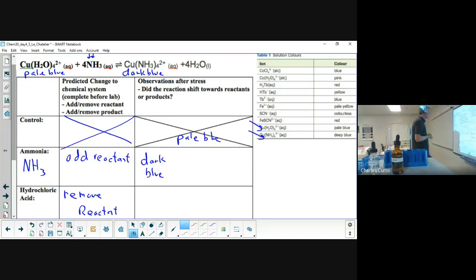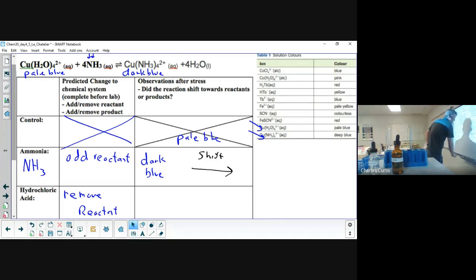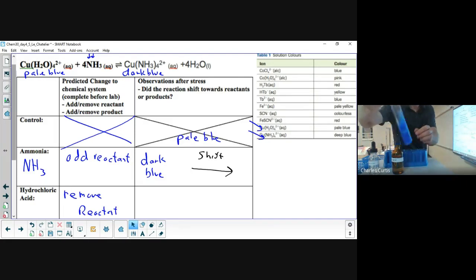So adding that reactant is making it go dark blue. Dark blue is a product. So it's a product, so it's a shift forward. Okay, we're almost done, and when we get to the evaluation, you're going to look at all of the add reactants and all the add products. So I'm going to take this same mixture that I got to shift towards products and turn dark blue after leaving it. Now the whole thing is a nice deep dark blue.